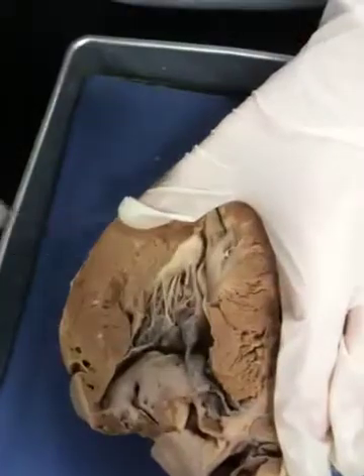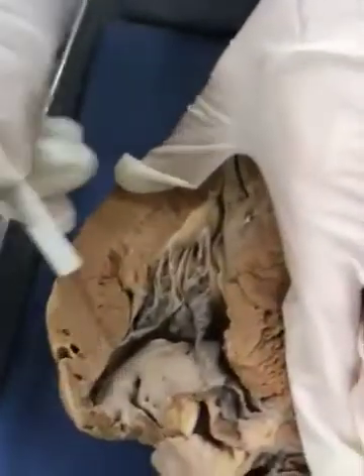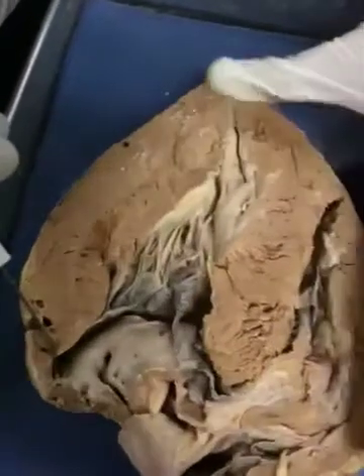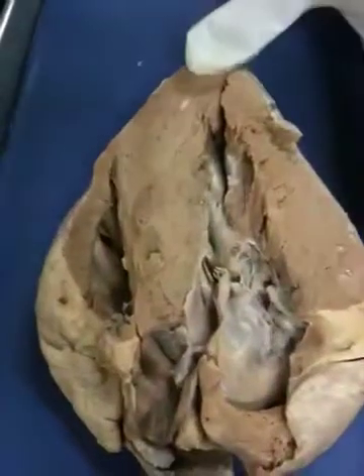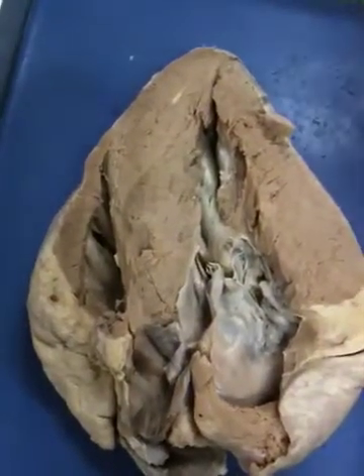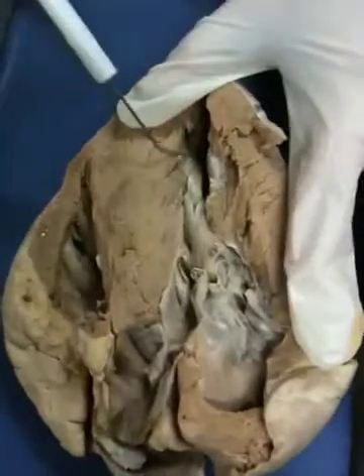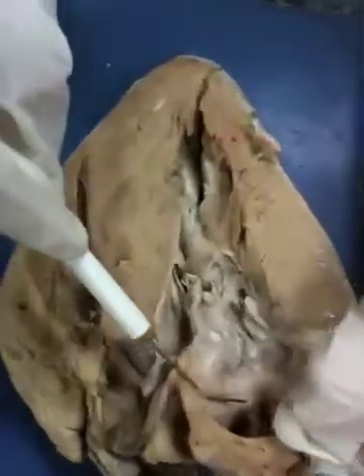Features that are really clear on this heart: the chordae tendineae and the bicuspid valve. You can see kind of a tree trunk structure in here — that's part of the pectinate muscles of the auricle, the left atrium. The left ventricle is on this side with a nice papillary muscle coming up. So that would be the bicuspid valve, and the pectinate muscles in there look like tree trunks.